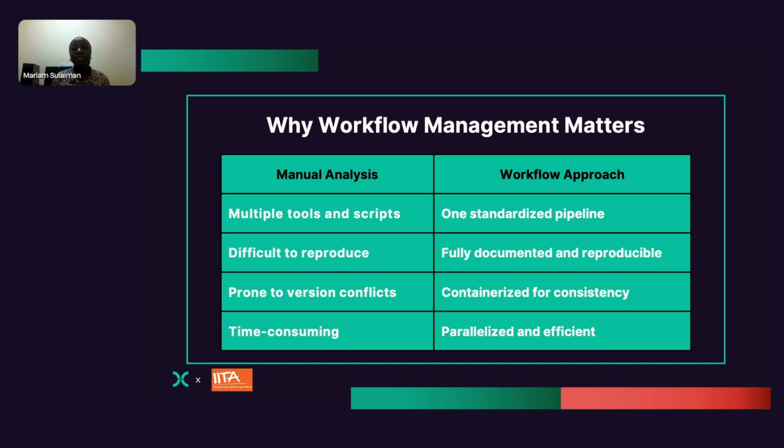So why exactly does workflow management matter? For me, when I started out with manual analysis, I realized quickly that it wasn't entirely sustainable because I had to run multiple tools and scripts, which was error prone. But with a workflow approach, a standardized pipeline gets me the results I need. Also, manual analyses are very difficult to reproduce because you sometimes lose track of the steps you take. But with workflows, everything is fully documented and reproducible.